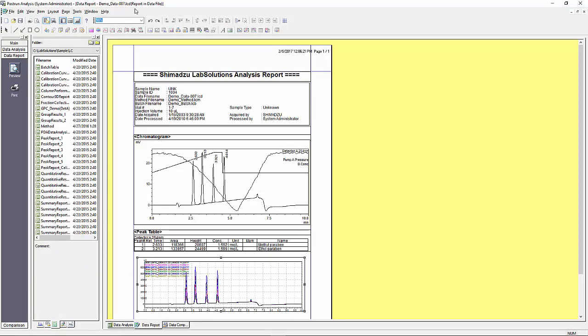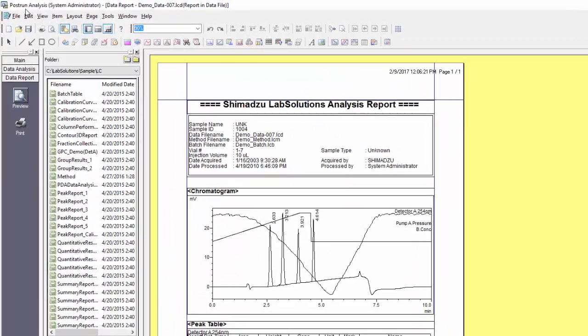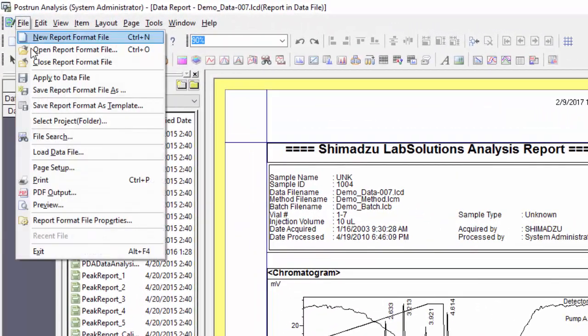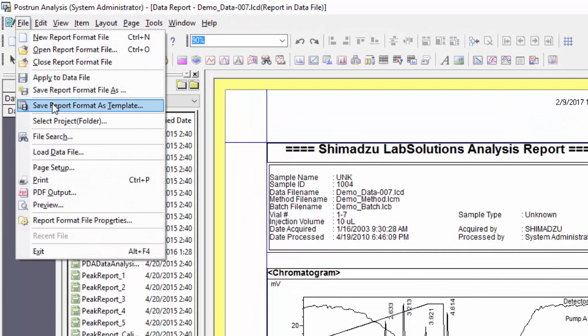If in the process of working on a report format you would like to save it as a template to use with future files, all you need to do is go up to file and select save report format as a template. This will keep all of your current property settings and positioning to be used with future data files.